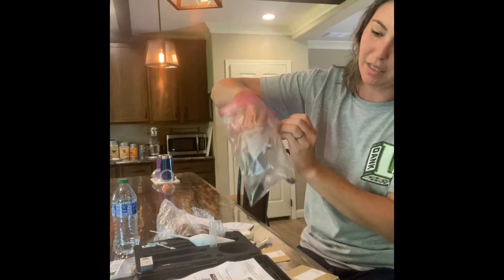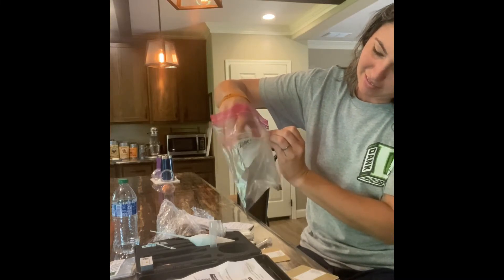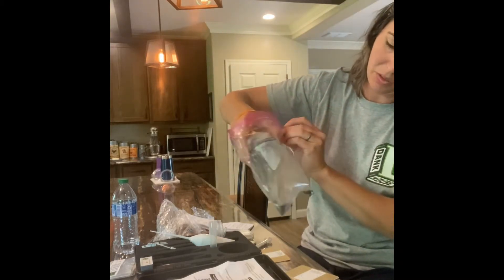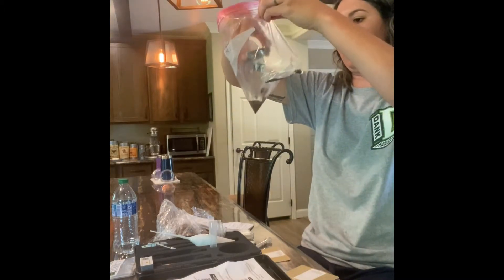These are just like little sink drain catchers. Same idea — once you get the tiny particles out, it's holding back the bigger soil particles and large organic matter debris.